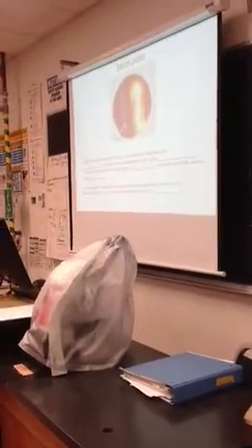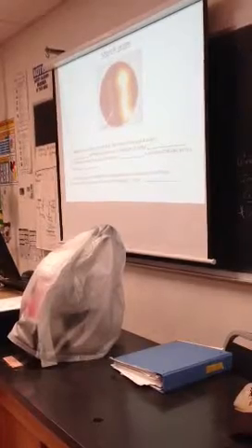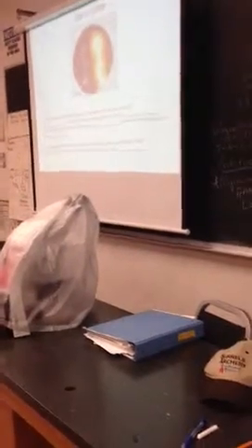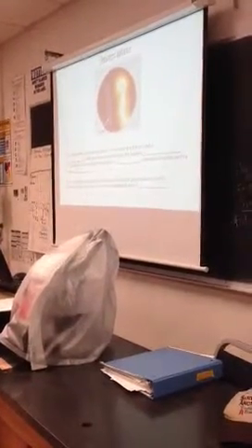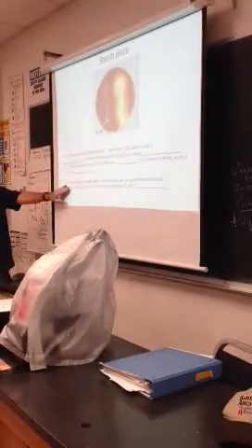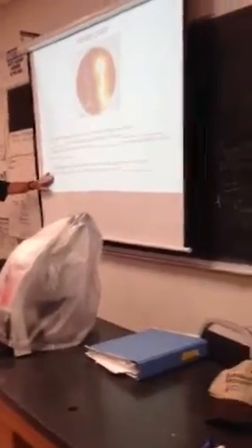All right, the positive starch test shows a zone of clearing, okay? The name of the starch is amylose, which is a polymer of glucose. And the enzyme we're testing for is amylase, A-S-E, amylose, amylase. The end product of starch hydrolysis is glucose, a monosaccharide with what formula? C6H12O6. What reagent is added after incubation to see the positive test in starch hydrolysis? Iodine. We use Lugol's iodine, but iodine works.